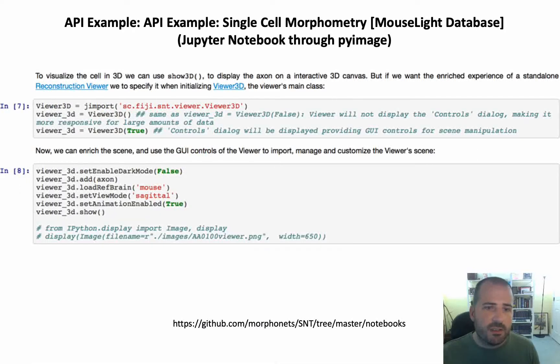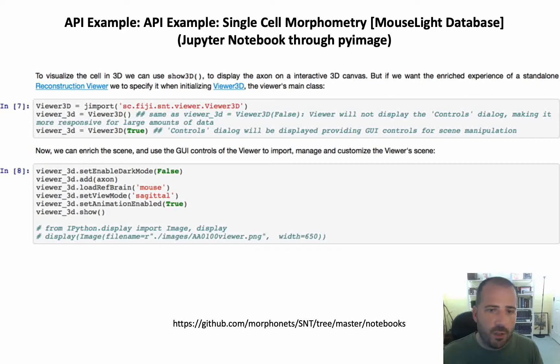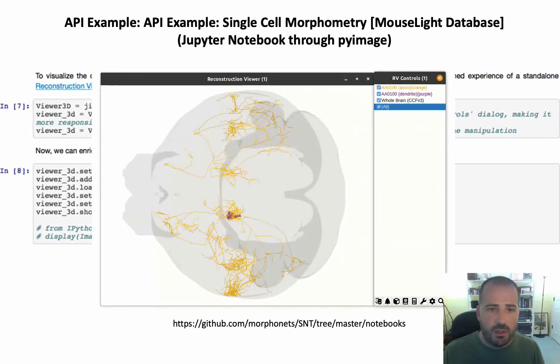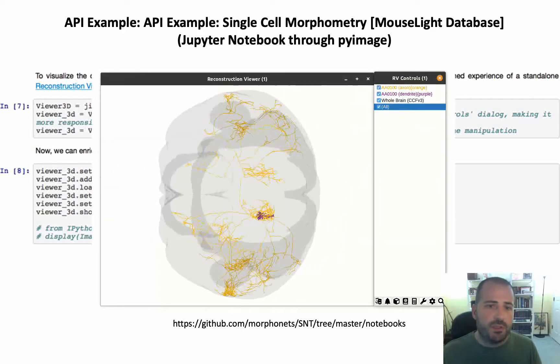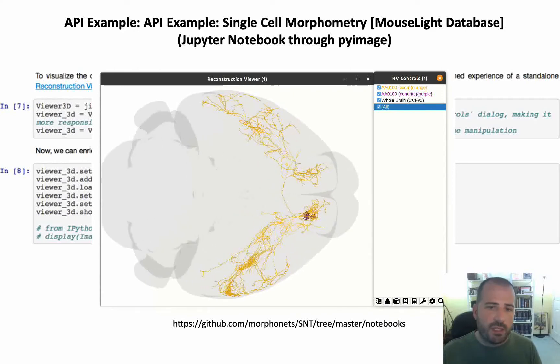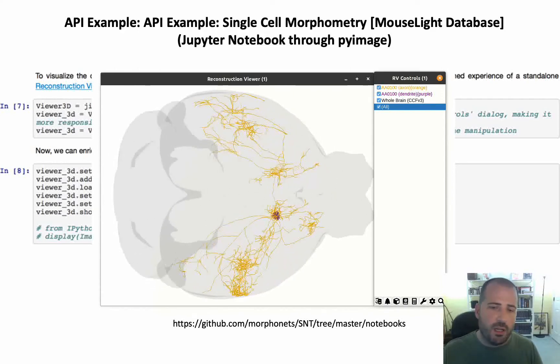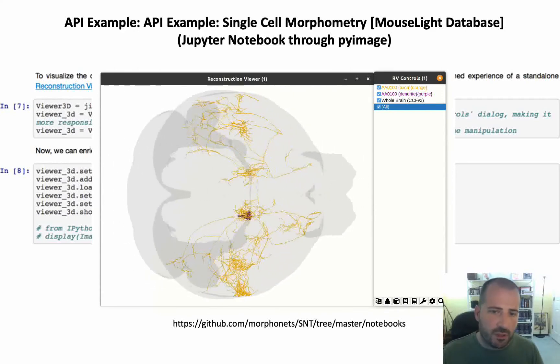And here is another example, in this case in a Python notebook running from a PyImageJ environment that is aware of SNT. Here is the code that produces an interactive 3D scene backed up by SNT's built-in reconstruction viewer.